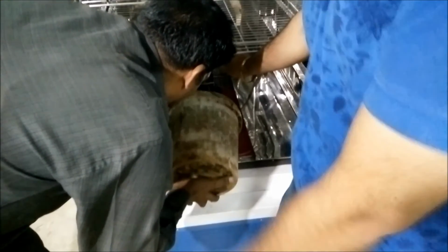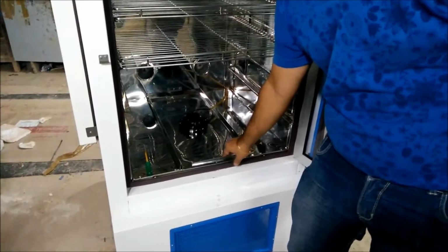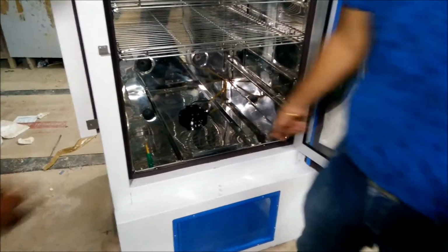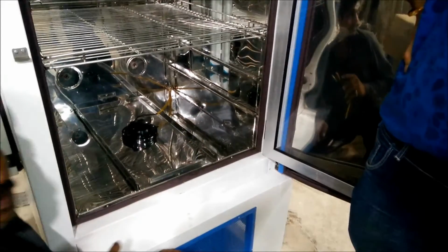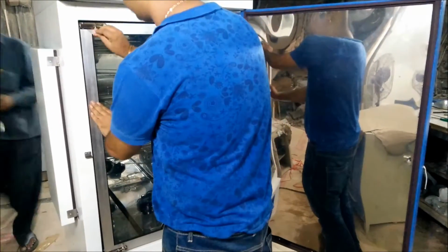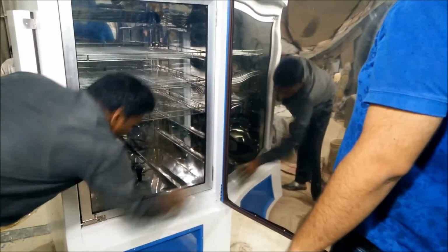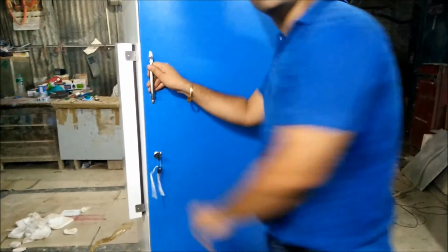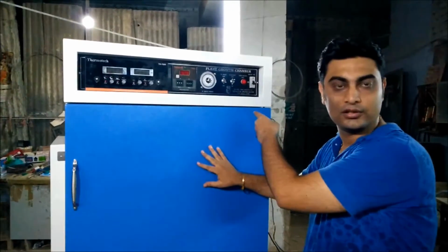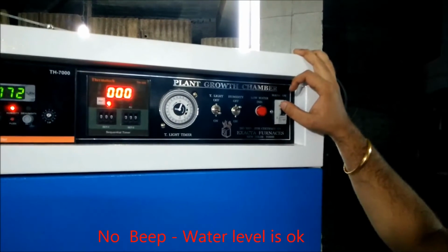You can also use a small mug if you want to pour in the water with the help of a mug. It will be easy for you. After filling the water, you have to lock the screw. Now the tank is full of water, so the beep will not come again. There is no sound of the beep now because the water tank is full.